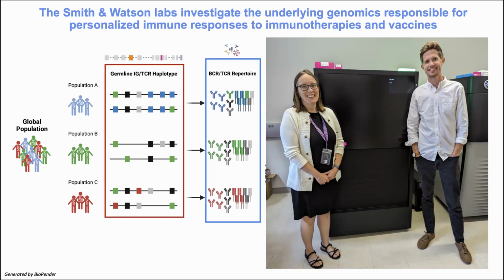So we've developed 2 novel assays that I'm going to present to you today, both a genotyping assay outlined in the red box with the genotype schematic on the top, and a near full-length repertoire profiling assay surrounded by the blue box with the little antibodies above it. These symbols I just put up there because I'll keep them in the corner of the slides so that the data that you see moving forward, you can tell immediately whether it was derived from DNA data or RNA data.